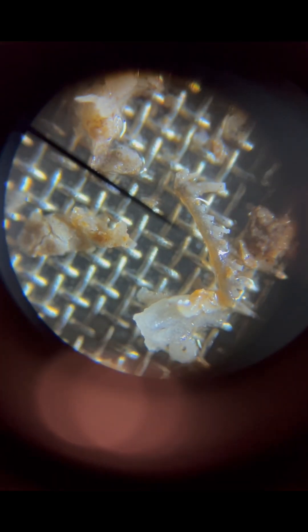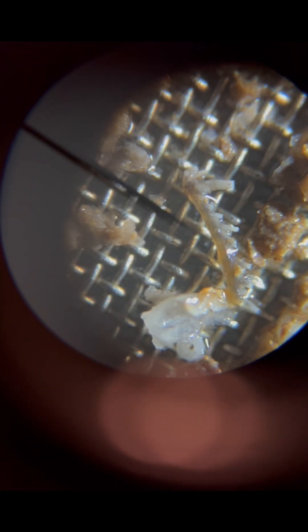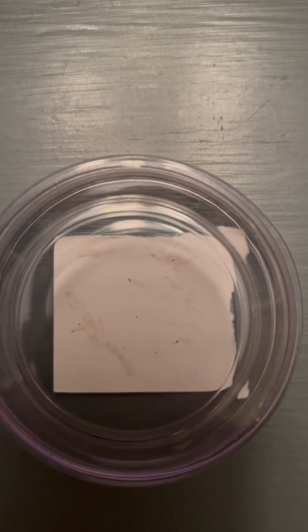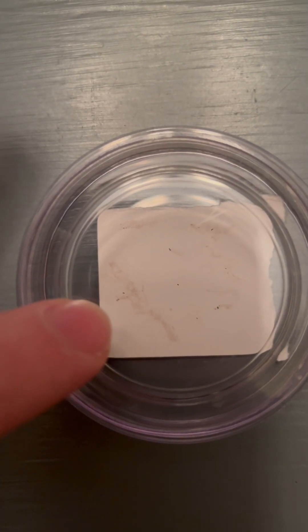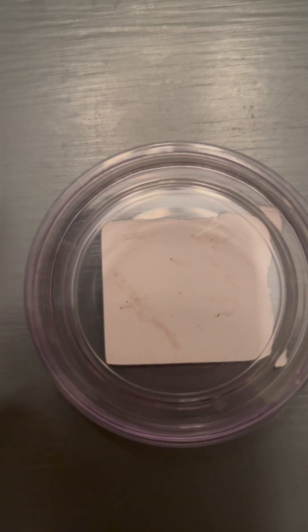Scolecodont. Those little specks are microfossils. One's a conodont and the rest are scolecodonts.